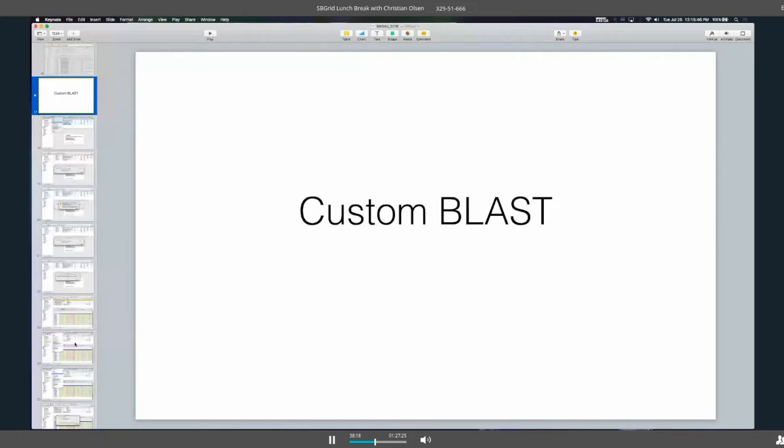And the first thing you need to do if you want to perform a custom blast search, which I contrast against the NCBI blast: a custom blast allows the user to define a group of sequences with which they can compare an unknown sequence against. Now, within Geneious, you can also take an unknown sequence and send that sequence to NCBI and do a search on those publicly available sequences.